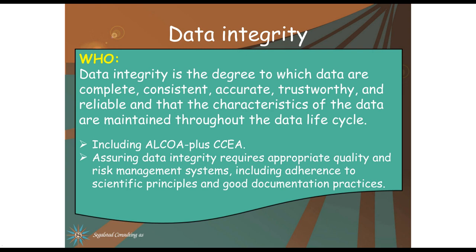Here's from the World Health Organization, WHO. They state that data integrity is the degree to which data are complete, consistent, accurate, trustworthy, and reliable, and that the characteristics of the data are maintained throughout the data lifecycle. This includes ALCOA-plus CCEA.